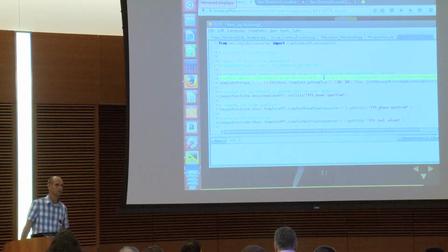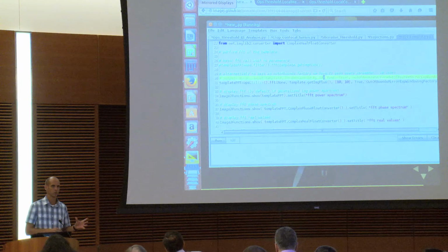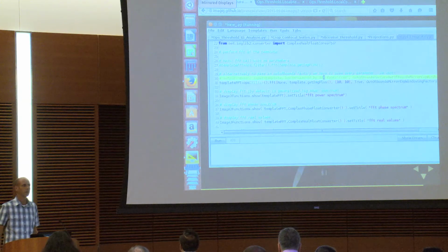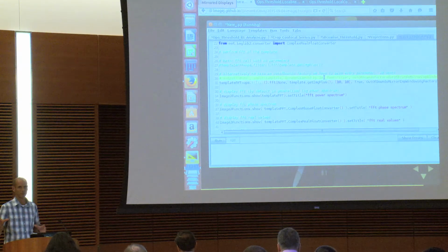of filtering, you sometimes have to precondition your images. You have to choose a strategy to deal with boundary pixels. FFTs work much faster at certain sizes, especially powers of 2, but there are some other convenient sizes. If you're ever looking at the underlying code, a lot of times it actually resizes the image a little bit, so it ends up being one of these faster sizes.